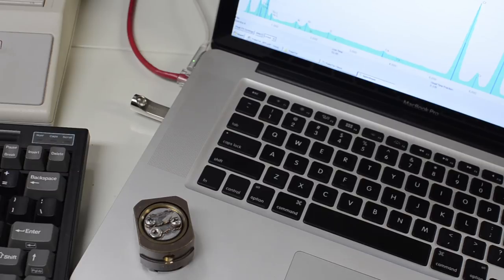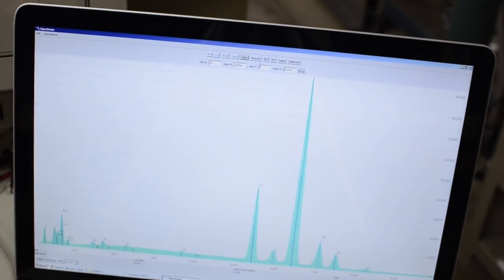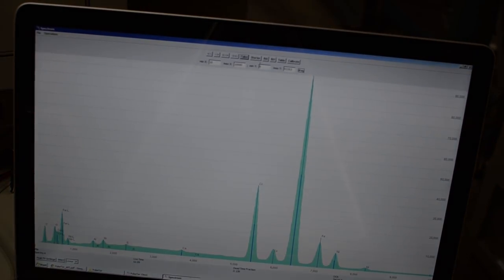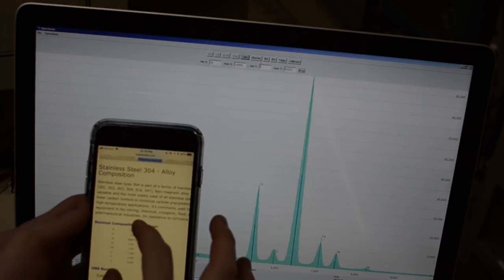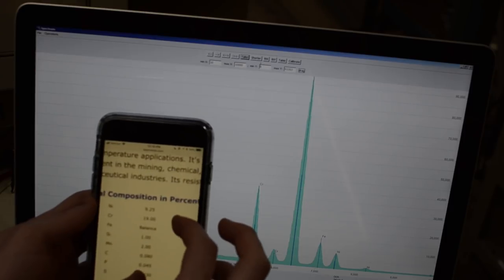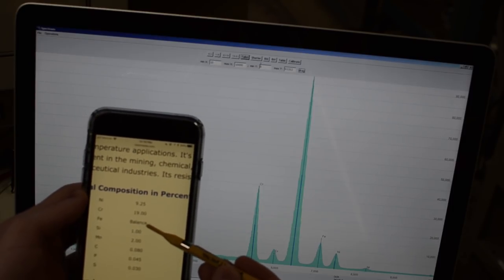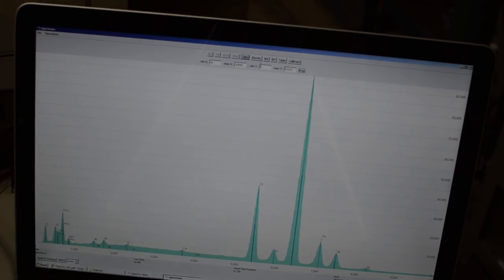So I took a look at the spectra for both of these unknown stainless steel samples here, both that nut and that little shaving. I'll show you the spectra of one of them. They're basically the same. And I'm almost 100% certain that they're both 304 or 18.8 grade stainless steel. On here, I've got common percentages for 304. The biggest things are chromium and nickel, and then of course iron is the balance. It's a fairly low amount of carbon in this steel.